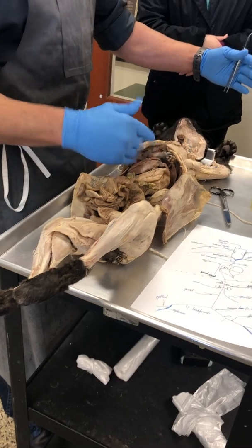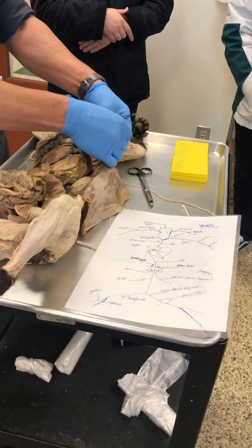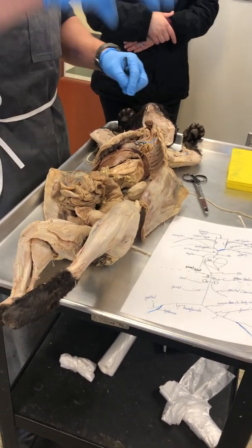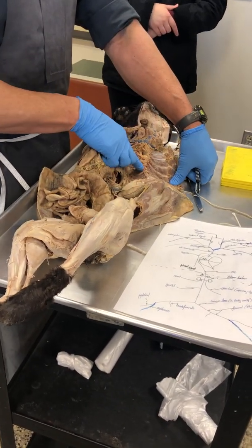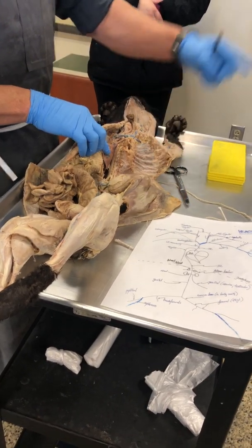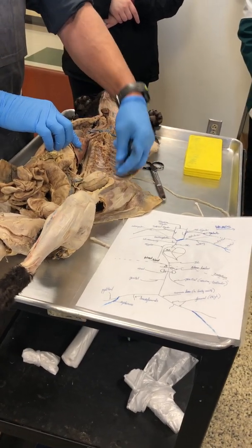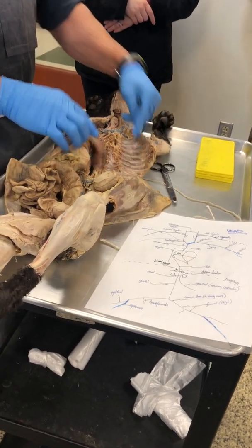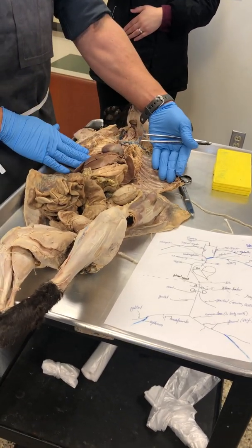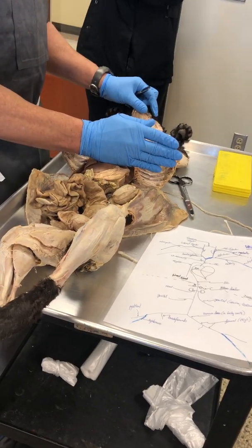So we cut through in the mid-sagittal plane next to the sternum. You can see there's the sternum, and we're cutting through the costal cartilage right there. So that'll stay like that because of that. So what I do, I break the ribs right there. You can see there with the bone cutters. Riggs right there behind you is the bone cutters. And I just break through it, open it up like that. So now it's open. So you can see there's the abdominopelvic and thoracic cavity right there.